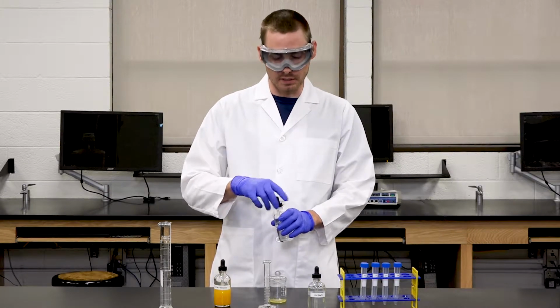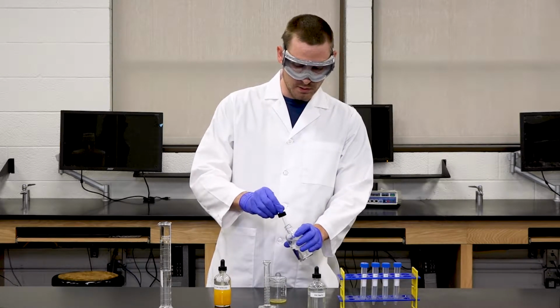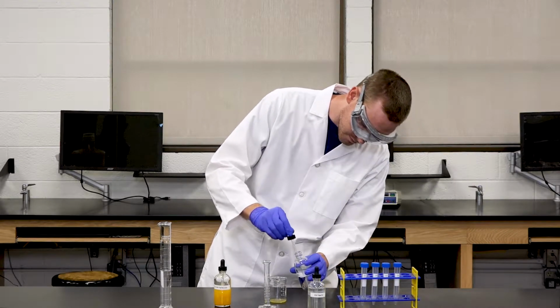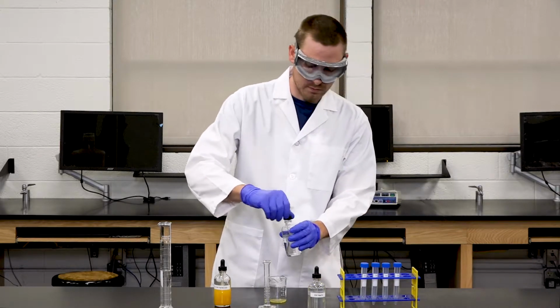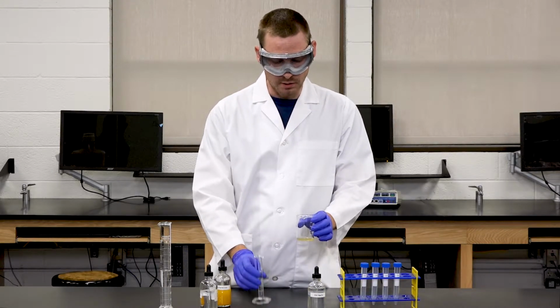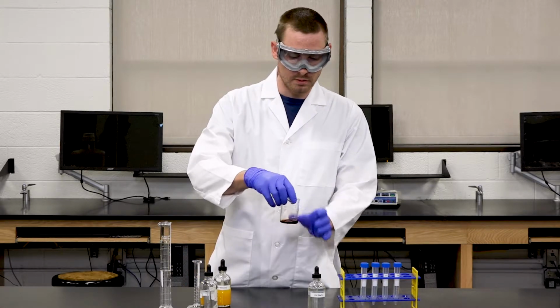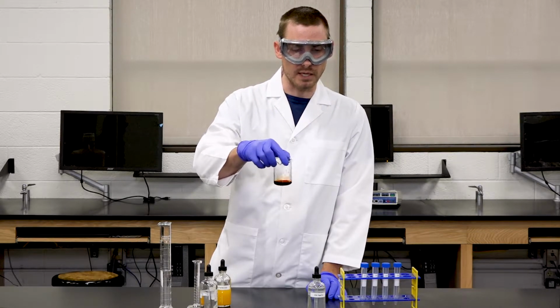Again, we'll measure out 3 milliliters of the 0.1 molar potassium thiocyanate solution into a graduated cylinder. We can then add this to the beaker and you'll see a color change. The iron thiocyanate complex is this deep blood red in color.